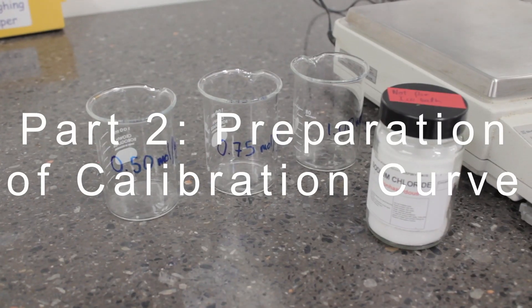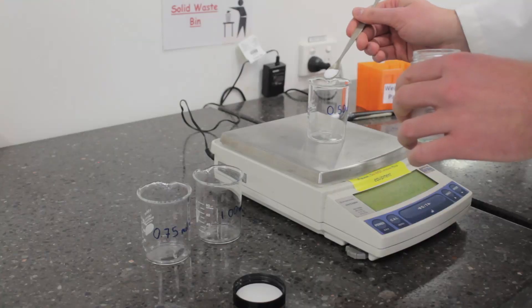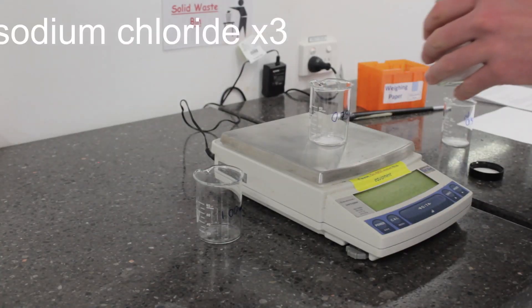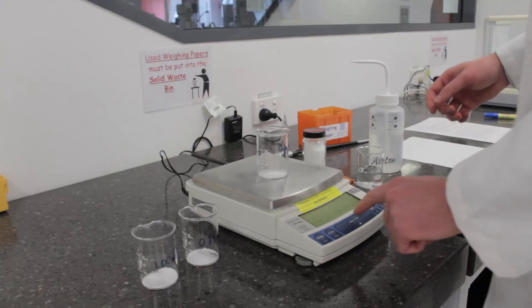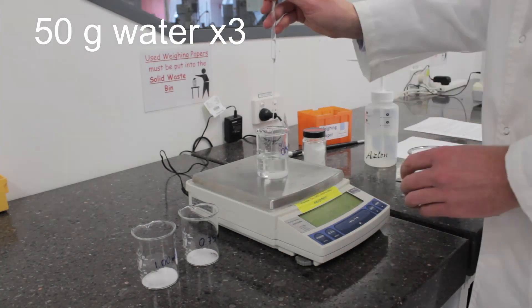Now let's construct our calibration curve. Using the masses you calculated in the pre-lab, weigh out the three masses of sodium chloride, tare, and add 50 grams of water to each.